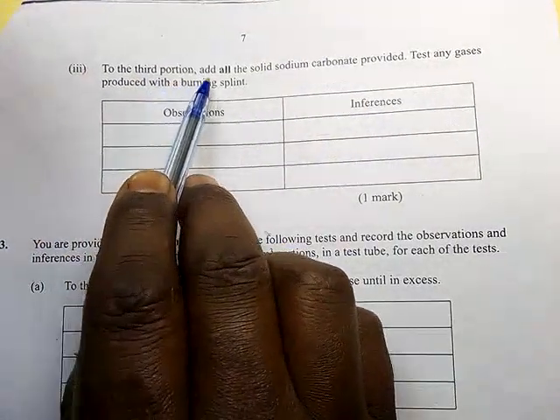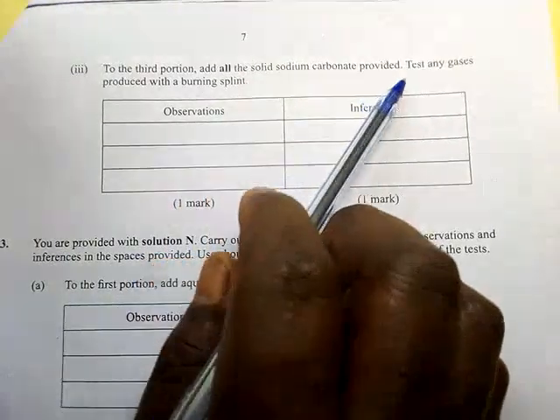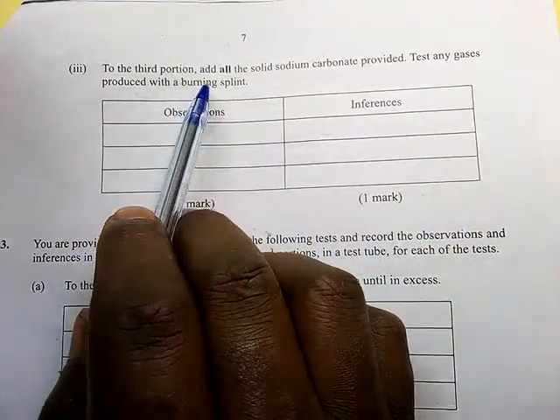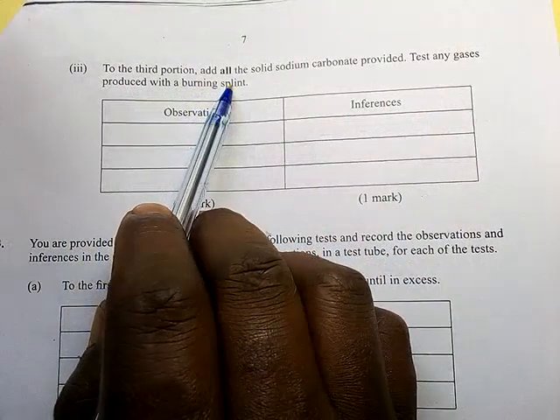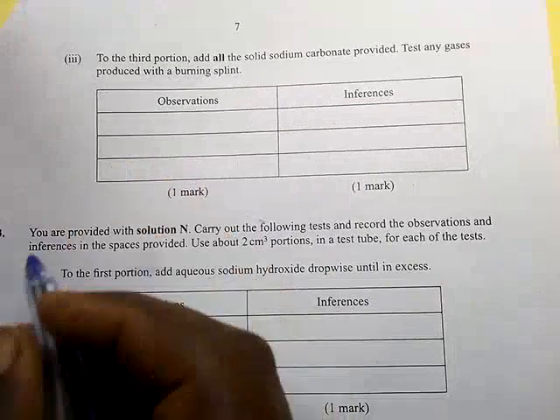The third portion, add all the solid sodium carbonate provided. Test any gas produced with a burning splint. So what was the observation?